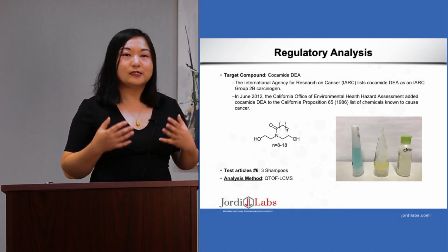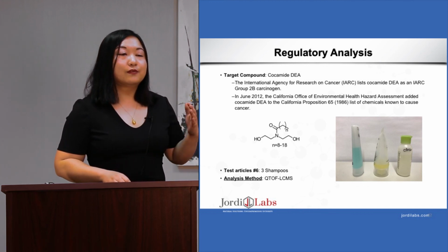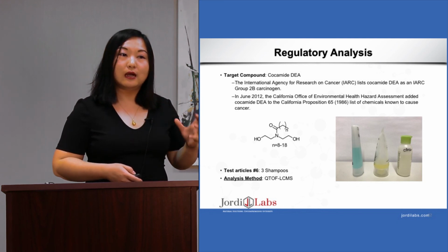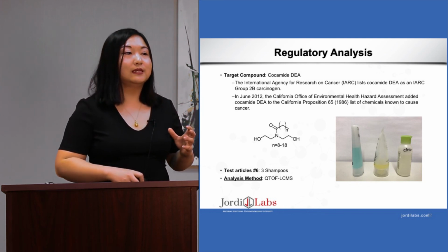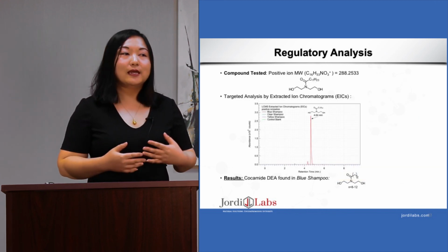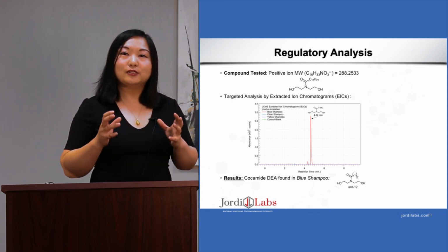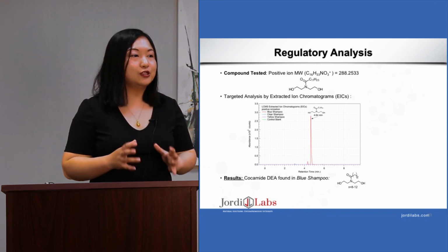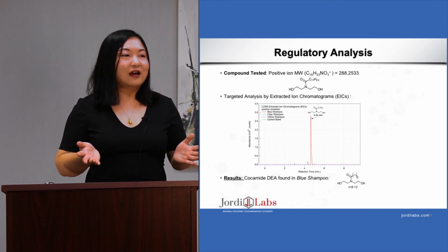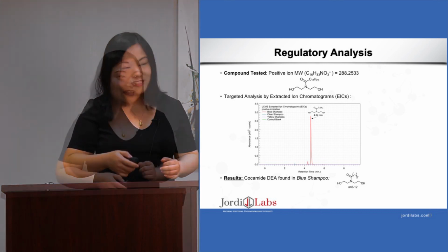They are carcinogens, which have adverse effects on your body. And so for this project, we want to screen targeting this compound to see if it's present in these shampoos. And it turned out, by using a target analysis by extracted ion chromatogram, we found out this compound is actually present in the blue shampoo shown earlier. So I guess afterwards, I just stay away from all the hotel shampoos I get.